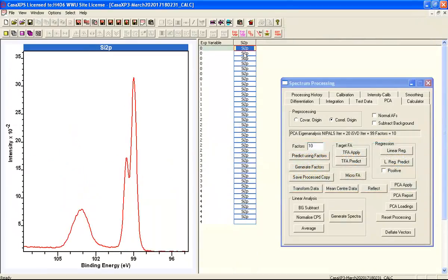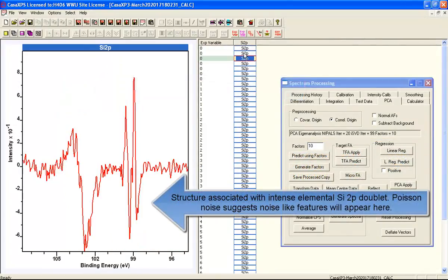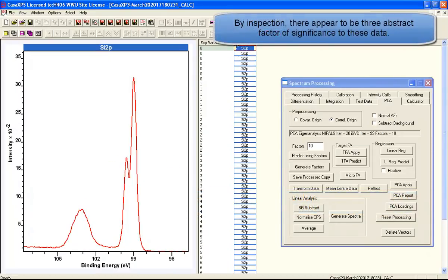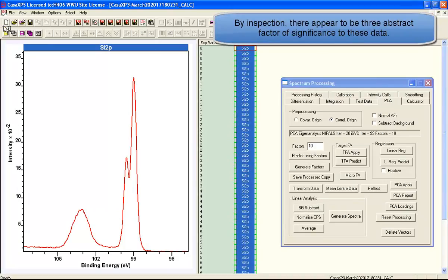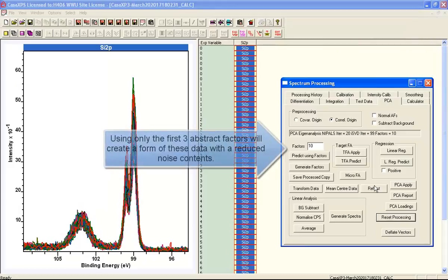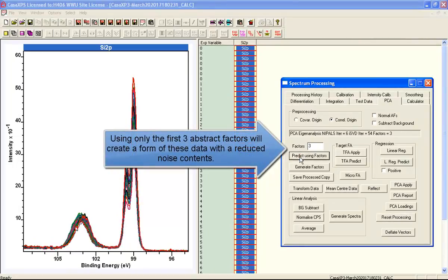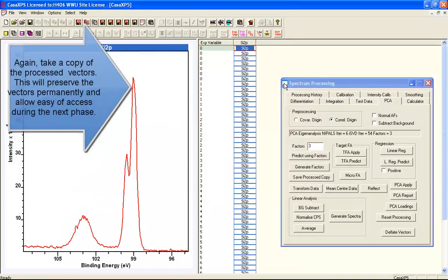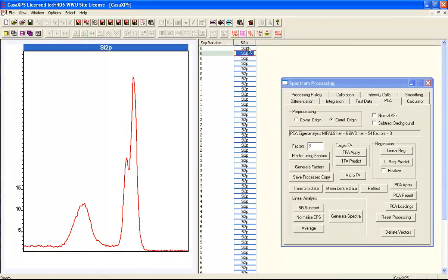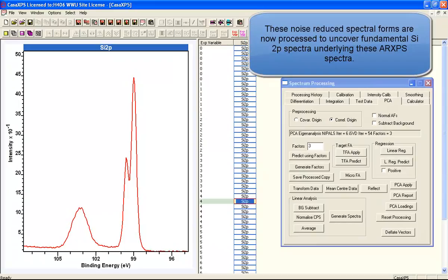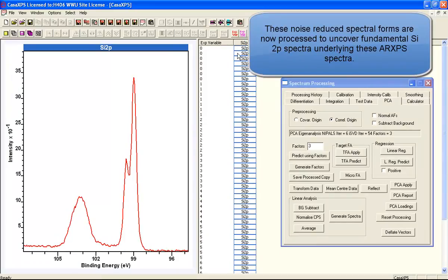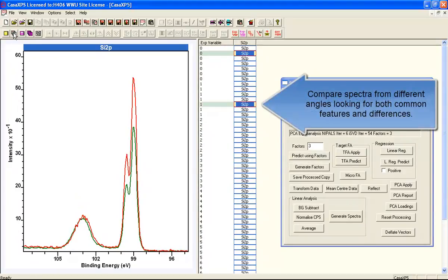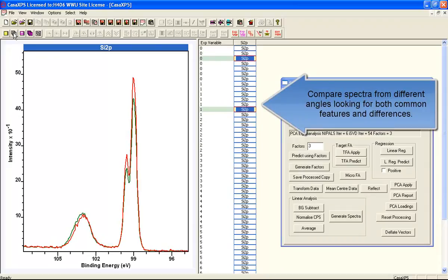The idea of the abstract factors is to see how many different shapes are within these data. You can see here we've got one that looks like the typical spectrum for silicon 2P with oxide, and then two more that represent shapes associated with the oxide — so three abstract factors. If we reproduce the data set using three abstract factors, we will have removed noise from the entire data set and left ourselves with a set of vectors which we can do further vector manipulation on. This is one of the key features of principal component analysis for the next step.